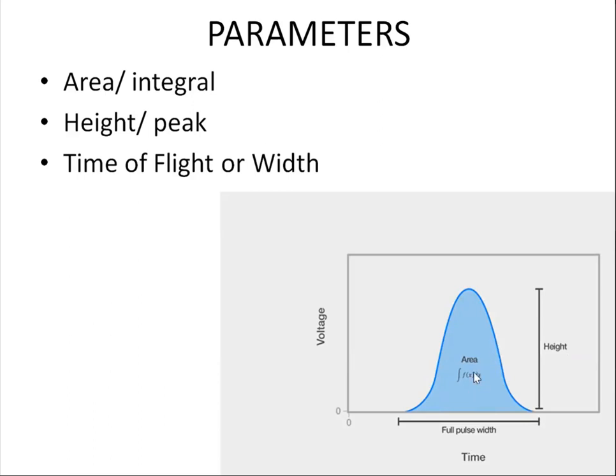Normally when you are analyzing, we'll be using area. When do you use forward scatter height during our analysis? Anyone? Like I told you, for fluorescent parameters and scatter parameters, mostly we'll be using area, which is otherwise called integral. But is there anywhere during a routine analysis we use forward scatter height in a plot?